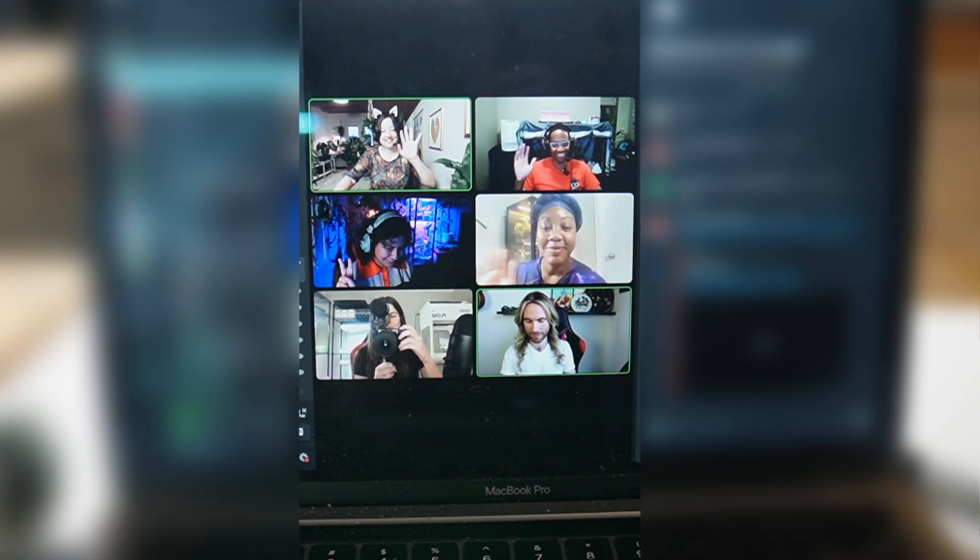Last night I autoclaved some media for begonias and for some African violets for some routine subcultures that I typically do every four to six weeks. If I seem tired today, that is because I had a YouTube collab last night that I'm so excited about, but one of the people in the collab actually lived in Australia, which meant it didn't start until midnight for me. Right now I'm going to take the media out of these pressure cookers and then I'm going to autoclave everything that's going to be underneath the laminar flow hood for the actual transfer process later today.